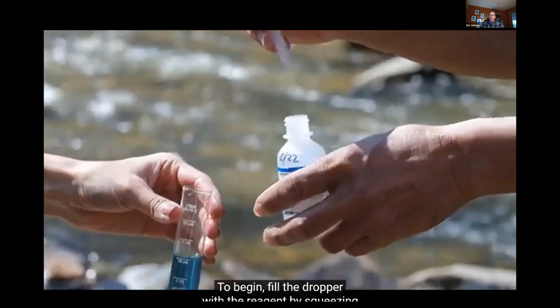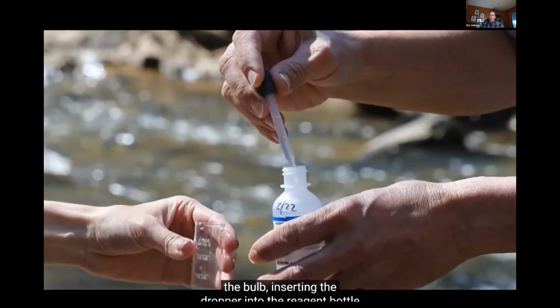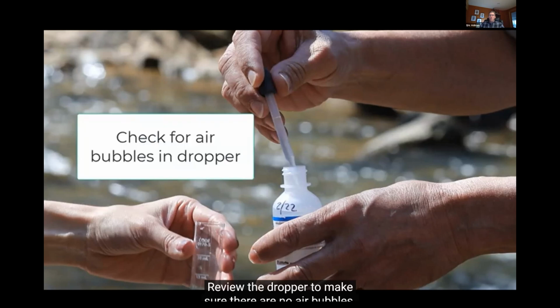To begin, fill the dropper with the reagent by squeezing the bulb, inserting the dropper into the reagent bottle, and releasing the bulb. Review the dropper to make sure there are no air bubbles. If air bubbles appear in the dropper, squeeze the bulb to empty the dropper and refill it.